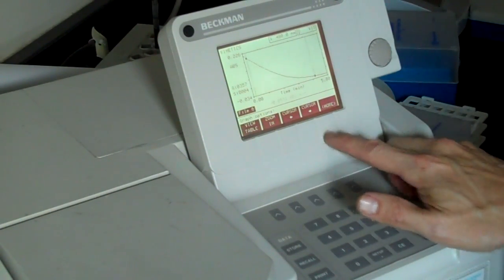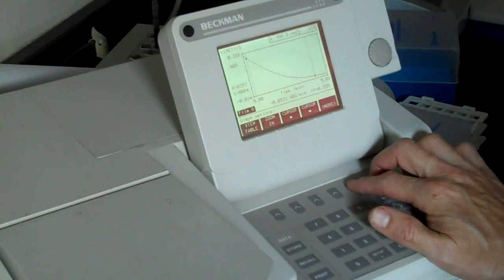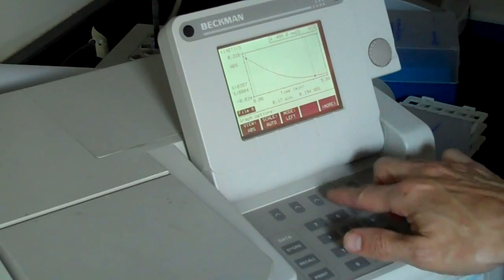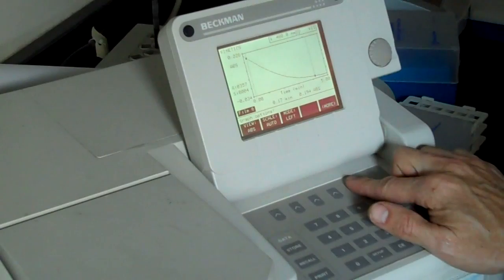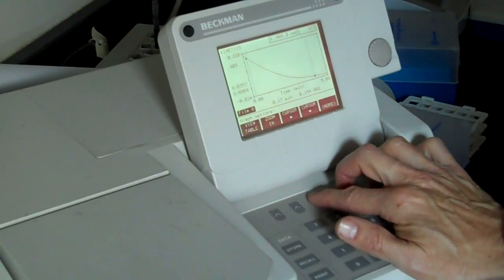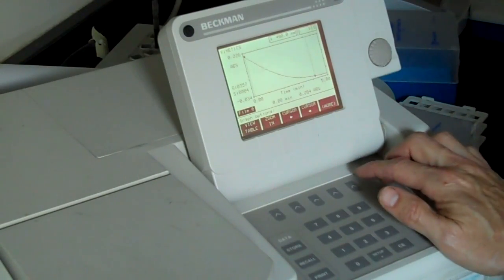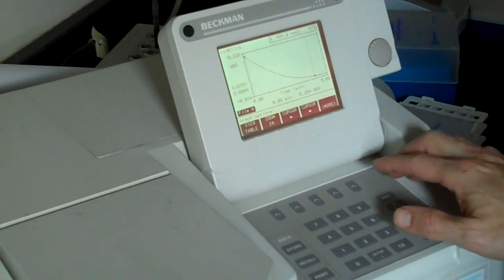The cursor buttons right now are moving both sets of cursors, both the beginning and the end. So I want to say mode left, meaning I'm moving only the left hand time marker, and now I'm going to move the left hand time marker to the beginning. Okay, so that's near the beginning. How about right there? So that's at 0.08 minutes. That's 1/12 of a minute. That's 5 seconds. So it's starting at t equals 5 seconds.